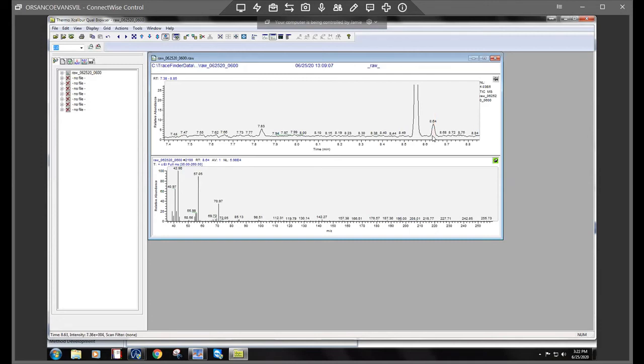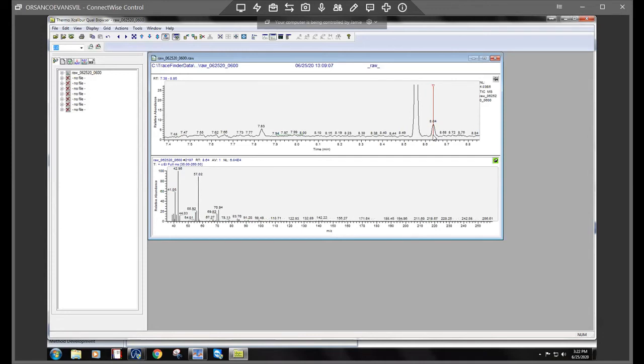Because technically your spectra could change throughout the entire peak because it scans so many times within each, I think per second that it could change your spectra or especially if there's two different co-eluting peaks, then you might get a different spectra. So the apex is usually the safest bet for when you're identifying.